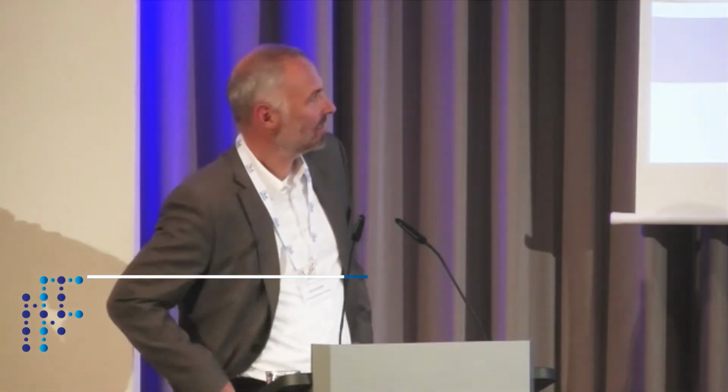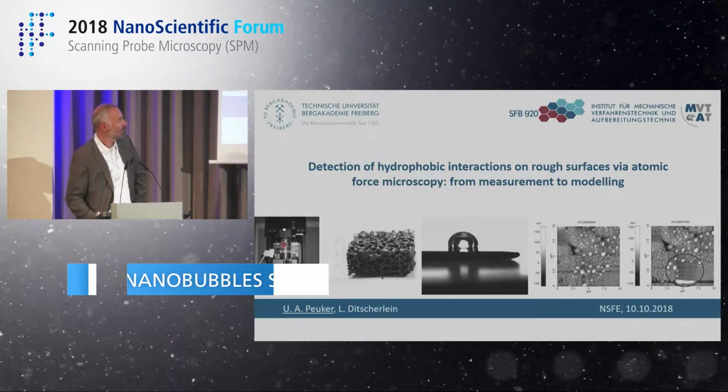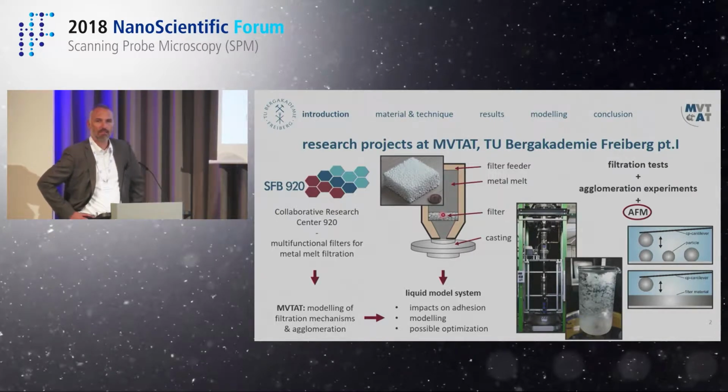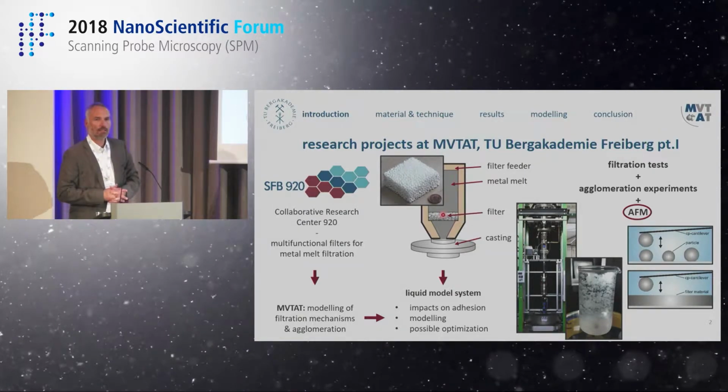I'm talking about going a little bit away from the smooth surfaces, and also away from the application on the micro scale. So we are heading forward to real industry challenges, but nevertheless data acquired via AFM can help us to understand. So we want to clean steel, molten aluminium, whatever you're going for casting. This is our large vessel, these are large scales, far away from nanobubbles. But nevertheless, those melts flow through filters like that. And in these filters, small particles are captured.